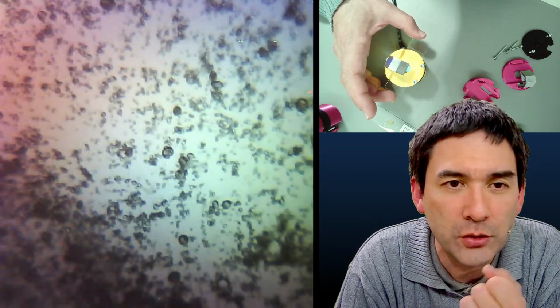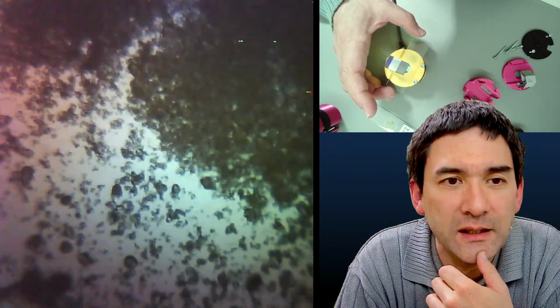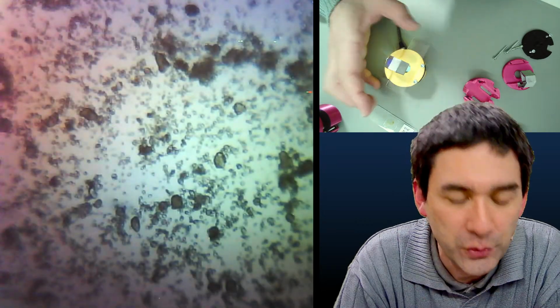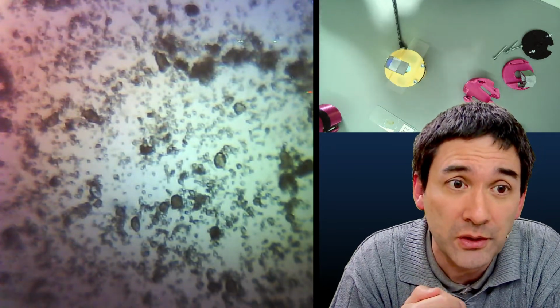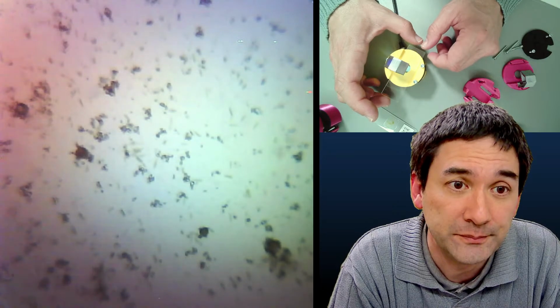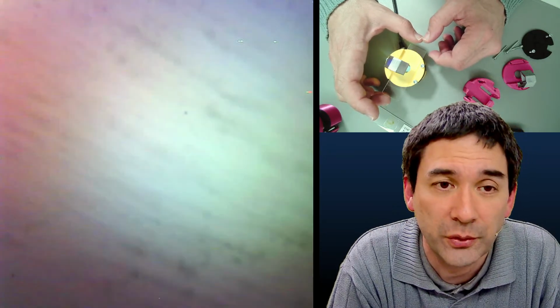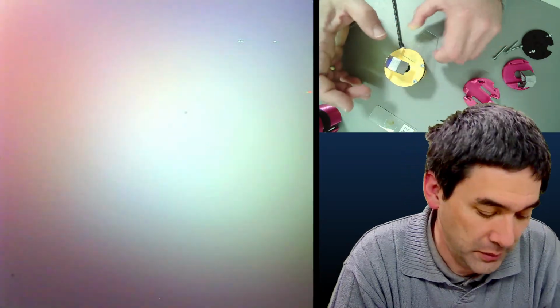So if you want to take a picture every couple of seconds or so, what I've not found out yet is if there is somehow a way to directly connect this camera over USB. After all, it has a USB connector to the computer, because this would probably increase the frame rate significantly. So this is something that I'm still trying to figure out. Okay. There are a couple of critters floating around here. Yeah, but you get the idea.